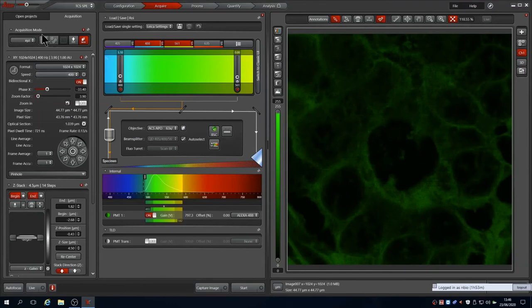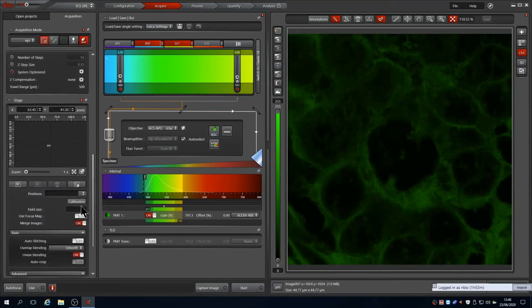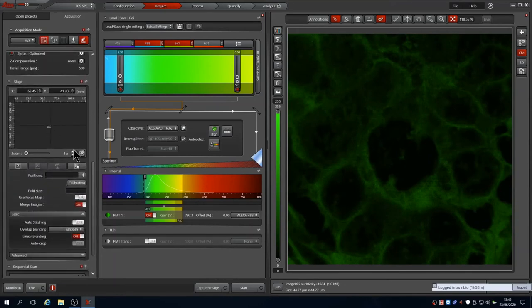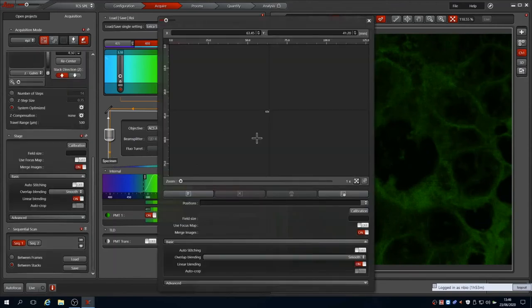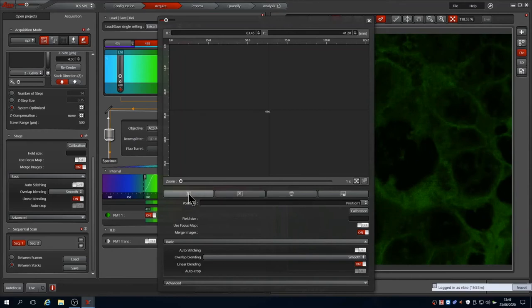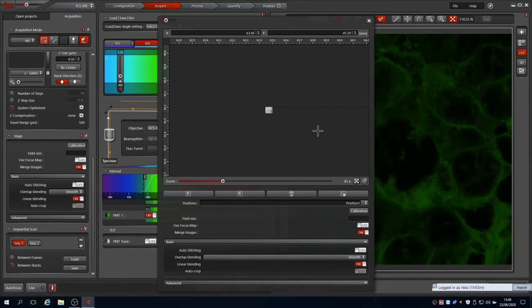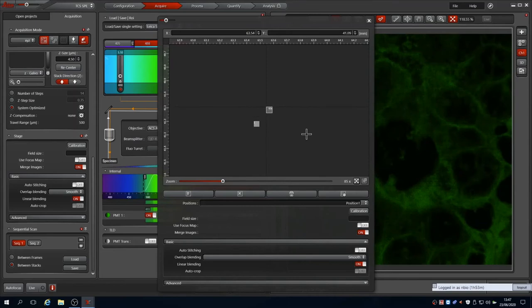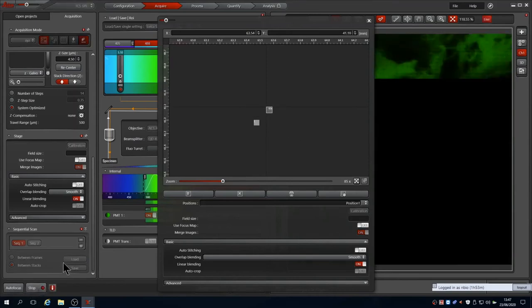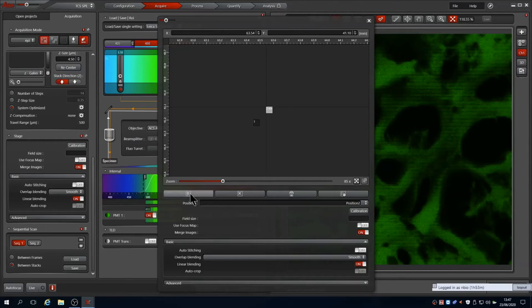Other options available include using the stage to perform tile scan images over your sample. Clicking the Tile Scan icon opens the stage controls below. These are easiest to operate whilst operating LASX by popping out the stage control window. This shows the current position of the stage. If you wish to mark this field, click the left hand button to mark the position. If we zoom the stage in, you can see that the point which you can see is actually the size of the field. Moving the stage controls moves the field.